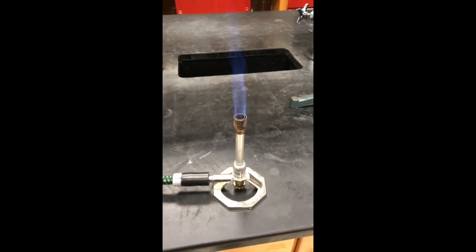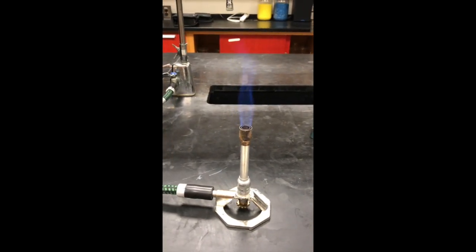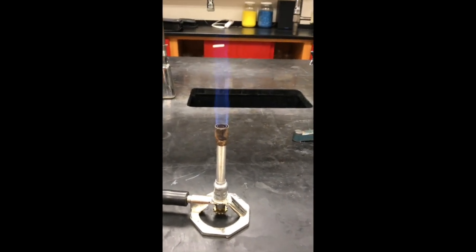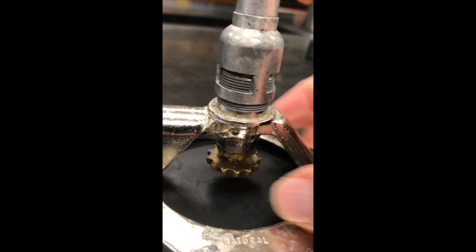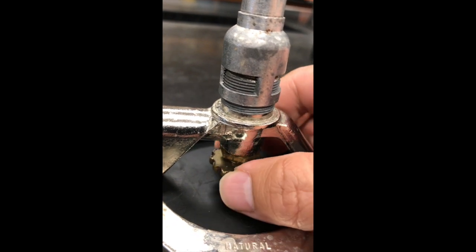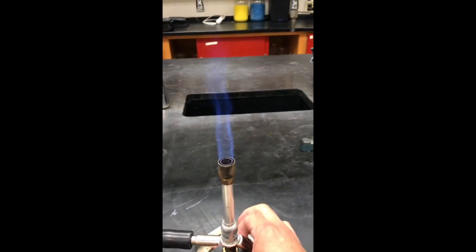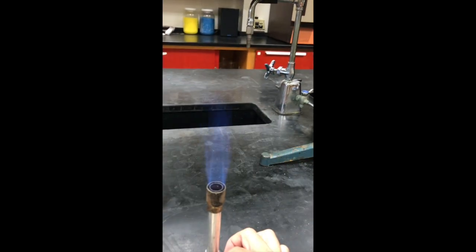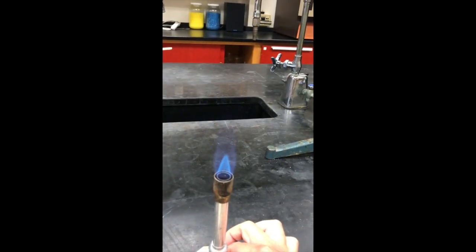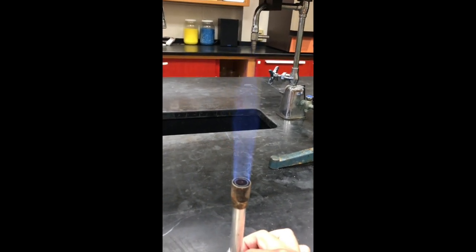So this is the first time that we'll be using the Bunsen burner, and I want to go over some basics. There are two ways to adjust your Bunsen burner. The first is the valve at the very bottom. If we turn this, it adjusts how much gas gets into the burner from the gas line. If I keep turning it, I can restrict how much gas gets in, and that will essentially shorten the flame. If I open it up, it lets the full amount in.